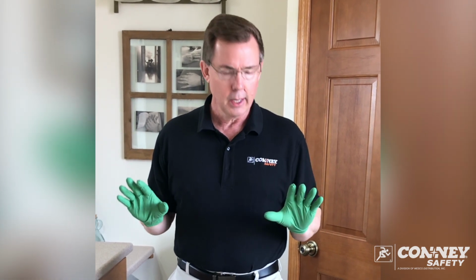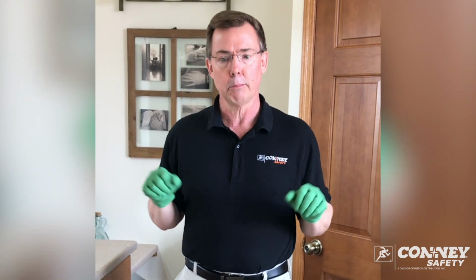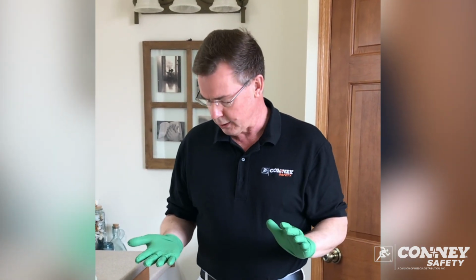With the pandemic going on and people wearing disposable gloves for other concerns of flu and viruses, we see a lot of people wearing disposable gloves even when they're going shopping and pushing a cart. It's really important to remember that even though your hands are technically protected from any viruses you may pick up on your hands, they are still going to be attached to the glove. So you've got to be careful about touching your face or anywhere on your body that you could transfer that contamination elsewhere beyond the glove. So very important to understand that.